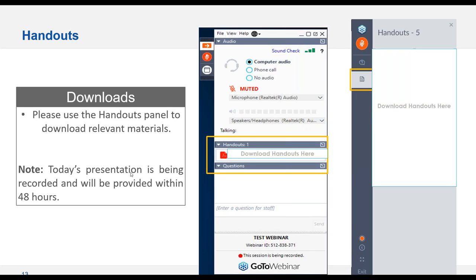And then one last question. Any tips for analyzing about 200 part per billion levels of lithium in the presence of 10,000 part per million levels of sodium? I've done some of this work in different brines and so forth. Typically what I've done is try a method of standard additions. I try my best to have a 10,000 ppm sodium calibration solution on top of my unknown.